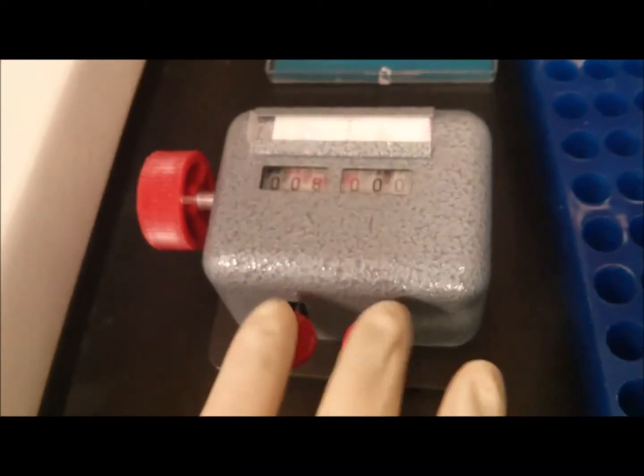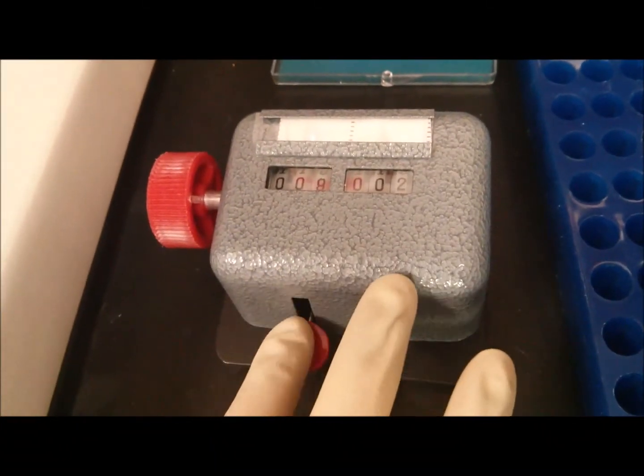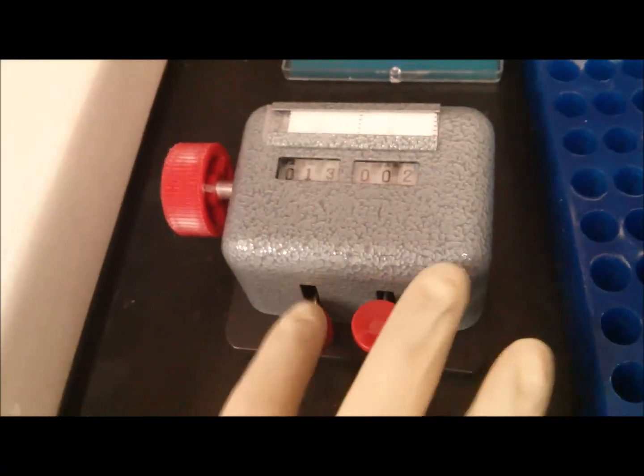This cell counting device makes it really easy to count the number of dead cells and cells that are alive. Under the microscope, there are 4 4x4 squares from which we count cells. If cells are on the edges, then only those on the top and left edge were counted.